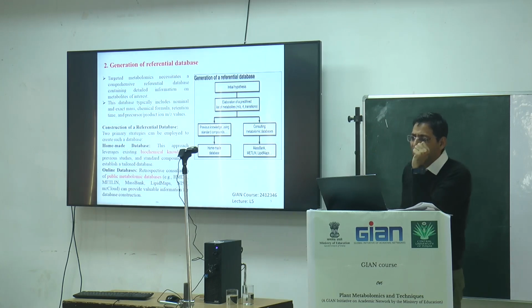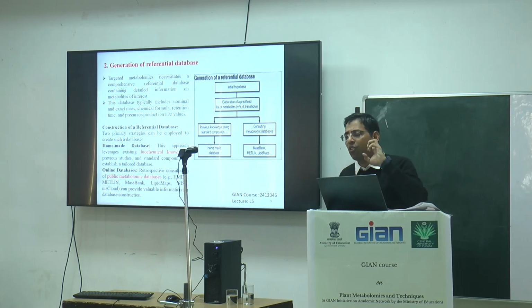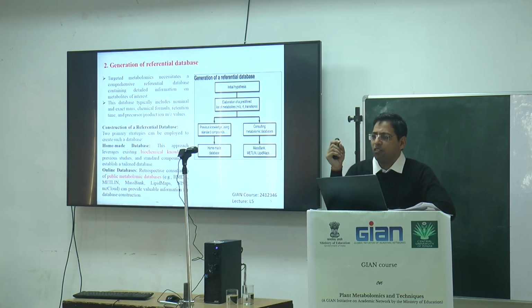So for that, typically some software is available. Waters has their own, Thermo has their own software, and you can use them. Every company in mass spectroscopy has their own software for the isolation and the identification of the metabolites. So if you have the Waters instruments, they have their own software, you have to use only that software. But the identification level matters actually.